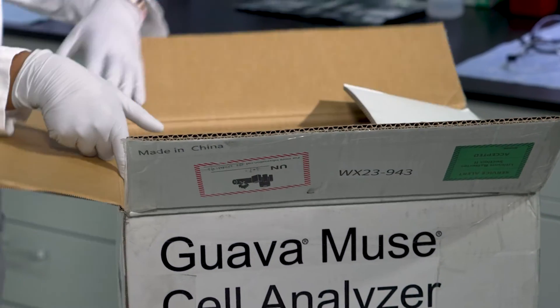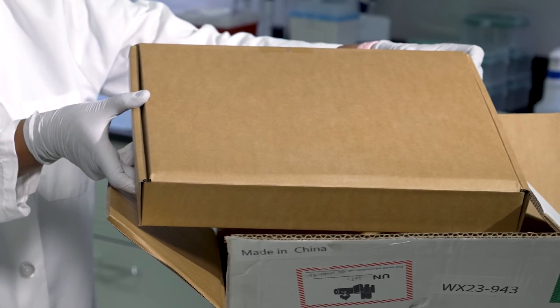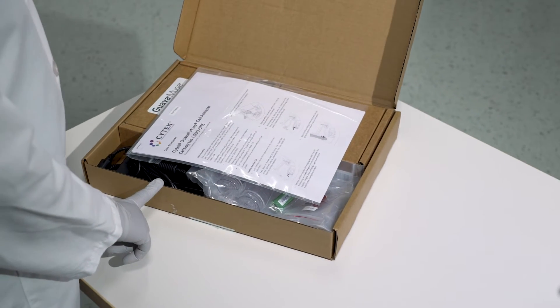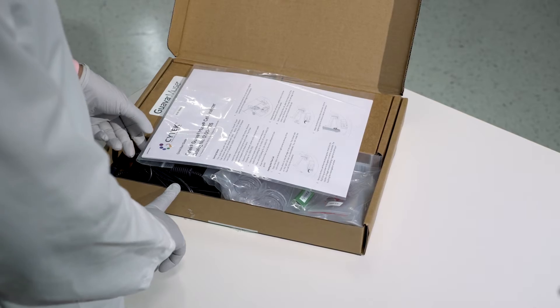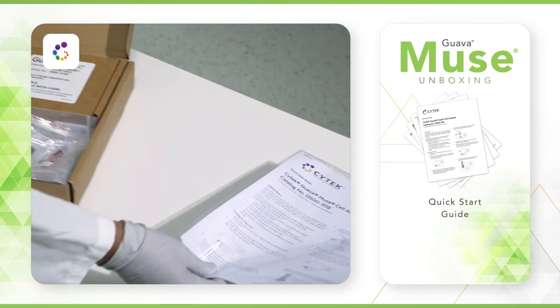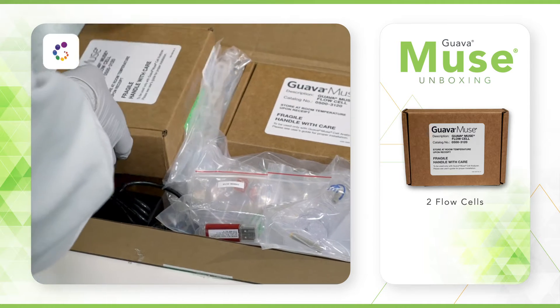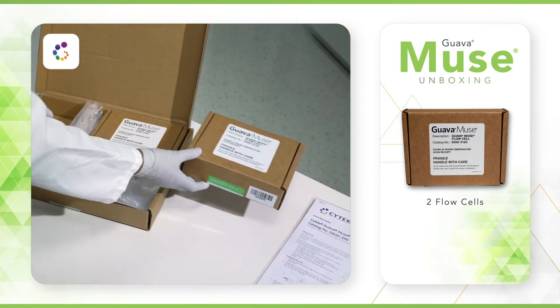Upon opening the instrument box, an accessory box will be located directly inside. Inside this box, you will find all necessary accessories for successful installation of the Guava Muse system. You will find a quick start guide for easy step-by-step instructions on how to get started. Inside the accessory box are two flow cells. These are very fragile and must be handled with care.